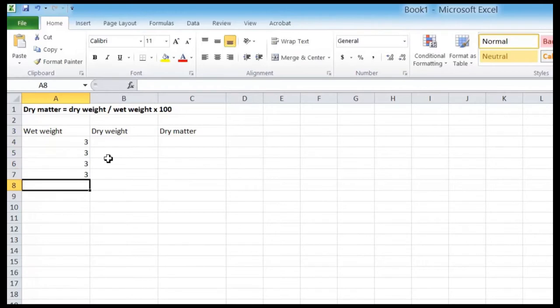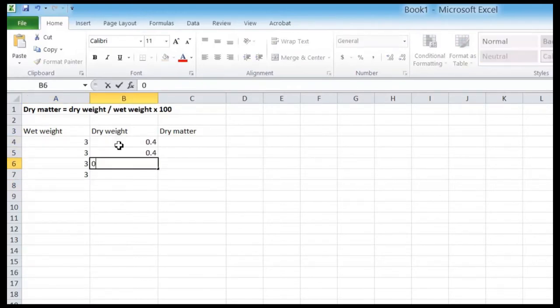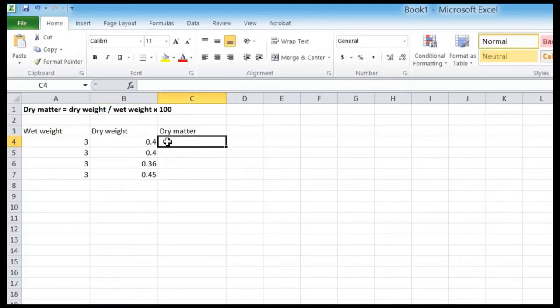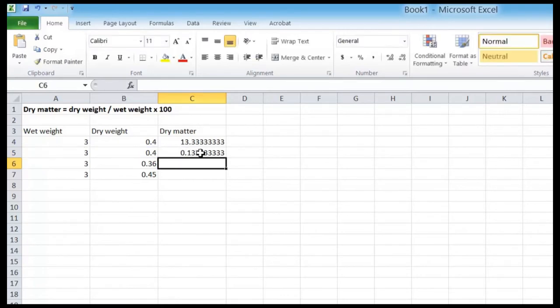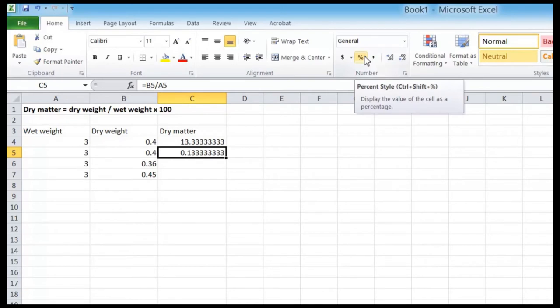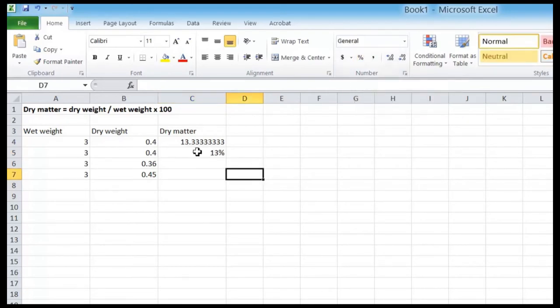Remember to subtract the weight of the patty pans before you enter your data. For this example, we will enter a wet weight of 3 and a dry weight of around 0.4. Type in your values and then enter the formula: dry weight divided by wet weight, then hit enter. This will give you a figure with many decimal places. You can finish the formula by adding star 100 to multiply by 100, or you can select the cell and click the percentage icon in the toolbar, which will automatically convert your figure to a percentage. Either way, you now have your dry matter percentage. If you have entered more than one set of data, you can copy the formula from one cell and paste it into another to avoid retyping it.